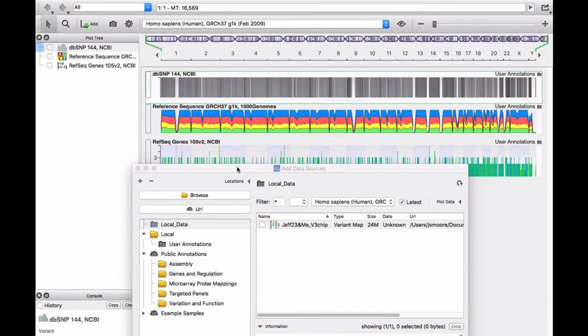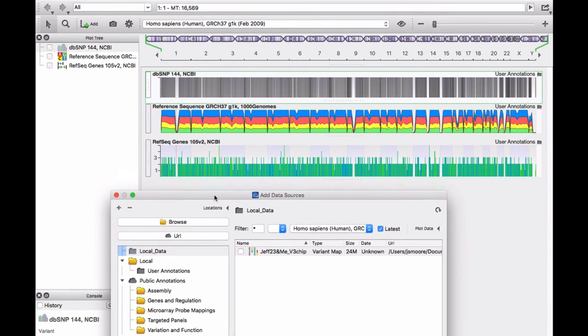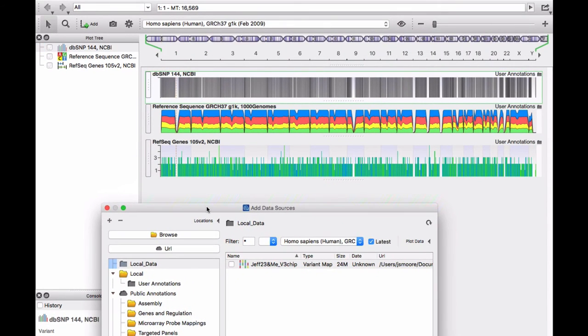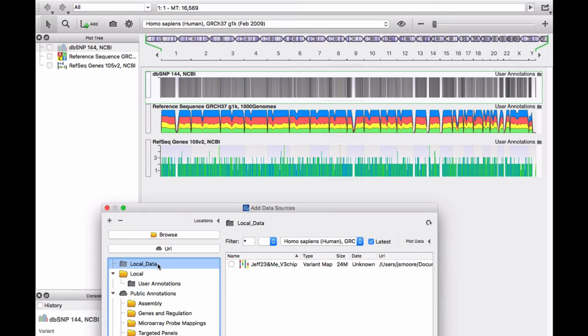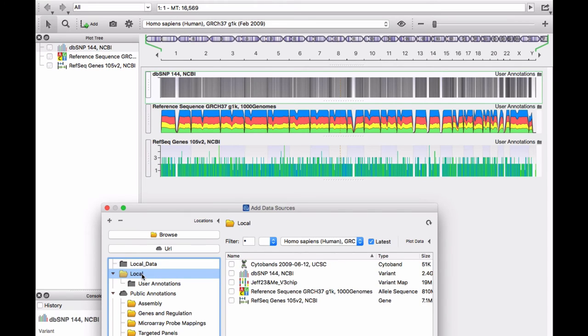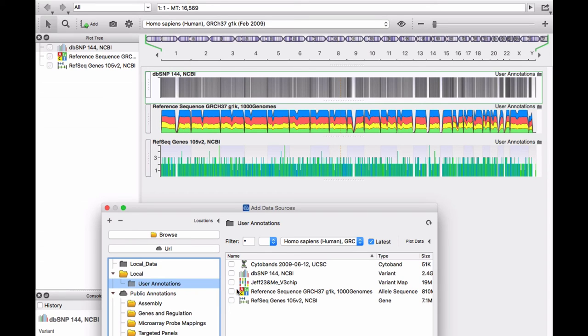Don't confuse the raw data file and the converted data file. The converted data file is now located in User Annotations. The raw data file is still in Local Data. You want the converted data file in the Local folder, also found in the User Annotations folder.